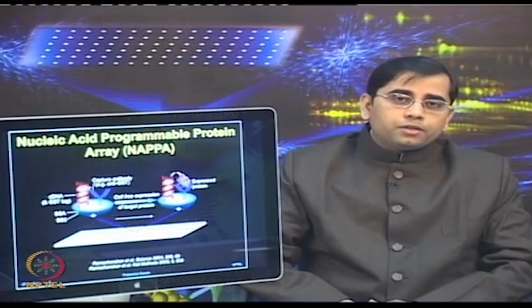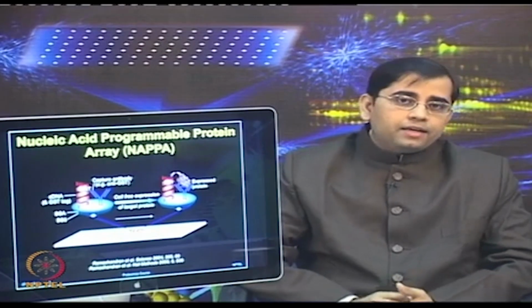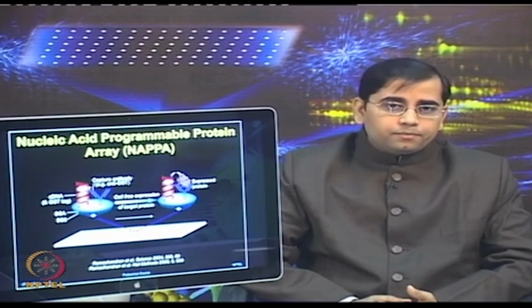So, in the NAPA approach, plasmids encoding the target proteins are fused with an affinity tag and those are affixed to the array surface.